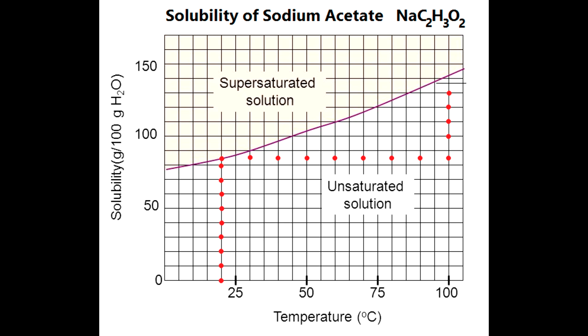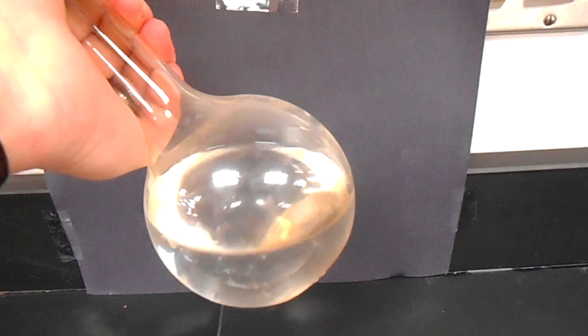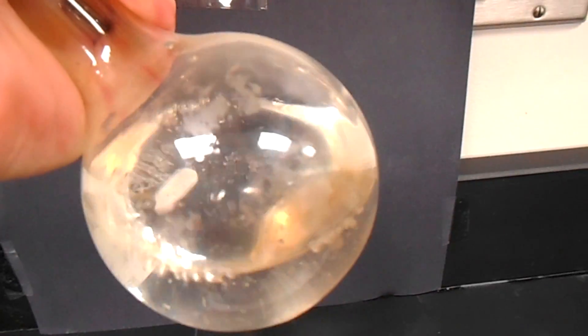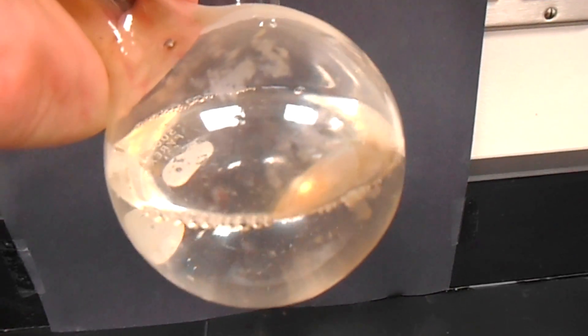Once we've got a saturated solution, some solutes — and sodium acetate is very good at this — can actually stay in solution as the solution cools. So we can get into this uncharted territory of a supersaturated solution and have a solution that contains more solute than it should be able to at room temperature. Now these solutions are very unstable, and you can see as I take this one and shake it around, if I shake it violently enough I can get that solution to break and get the solute to come out of solution. It's a pretty rapid process, and it's kind of amazing to watch.